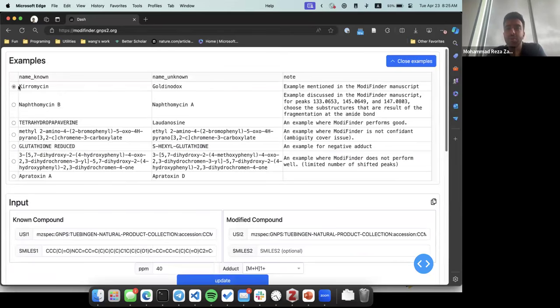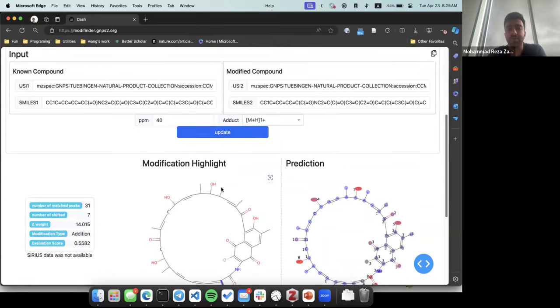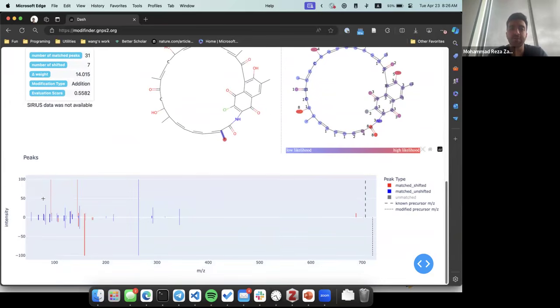One good thing about this whole structure is that the way we are annotating the peaks is that we are using the MAGMa algorithm. However, it is not necessarily the best way. I'm sure the chemists here have way more knowledge than an in silico fragmentation tool. Because this tool is ambiguous and it's not the best possible annotation tool, we have provided this ability for you to modify these annotations and therefore achieve a better result.